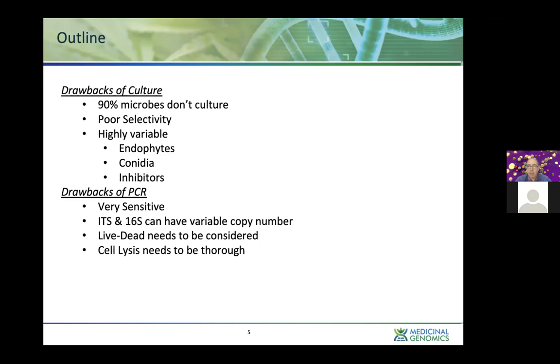Fungi also have unique biological anatomy. They have conidia. We call these things spore grenades. They have a host of maybe 100 or 1,000 spores on the end of a biological feature that you can easily pipette up in one go and get very stochastic answers. You know, thousands of CFUs in one plating, and when you do it again off the same matrix, you end up with nothing. This is what is known as heterogeneous macrocolonies in the filamentous fungi world.